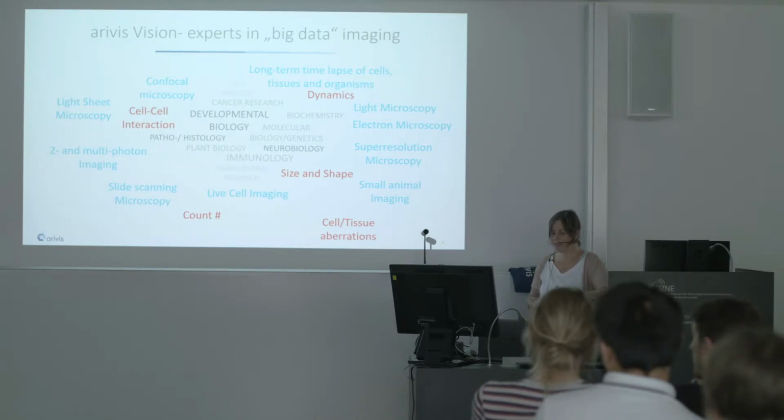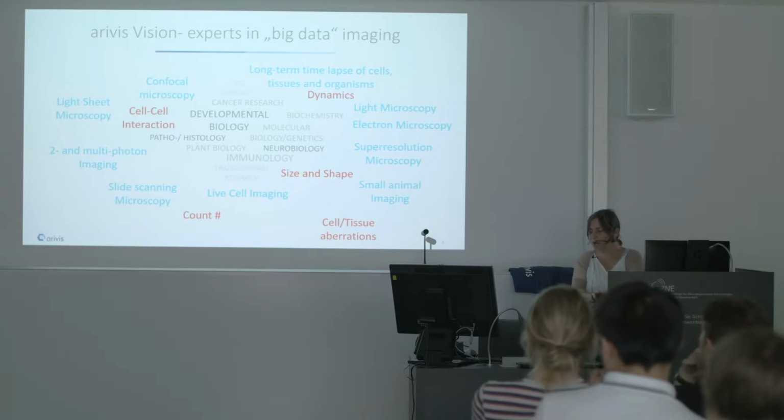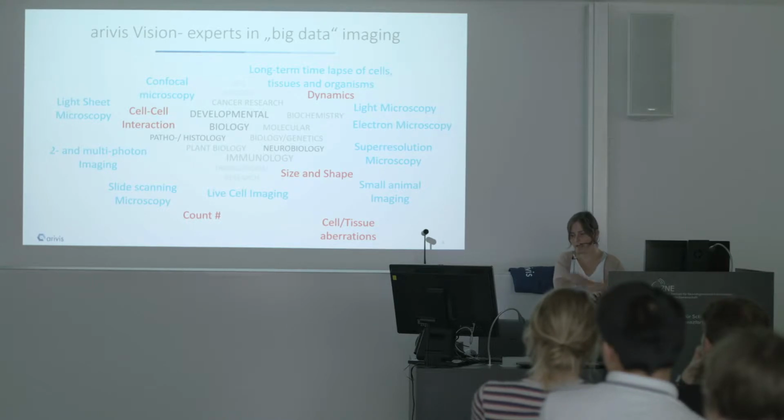So this is just an overview on what imaging modalities you would have used and generated data, and would then maybe do a follow-up analysis in ARIVIS, and what kind of quantitative answers you would want to get out of this data.